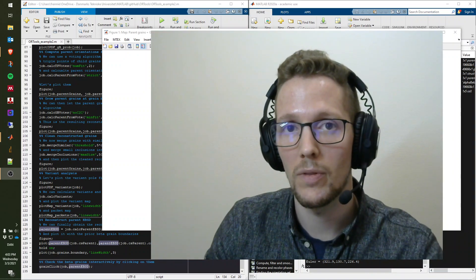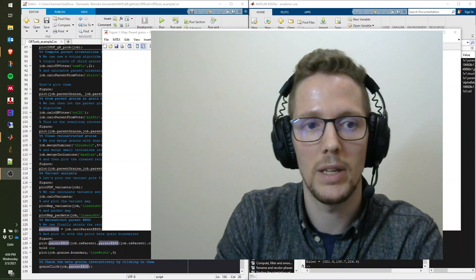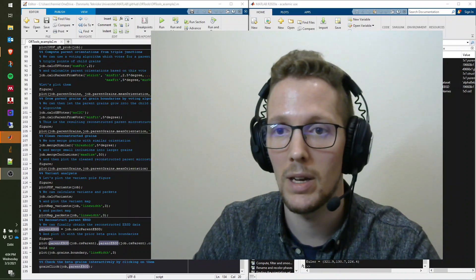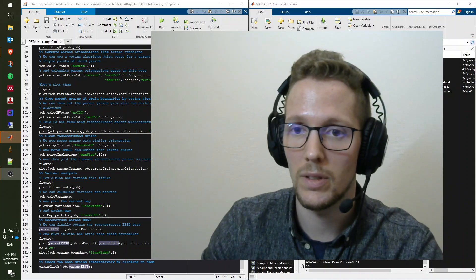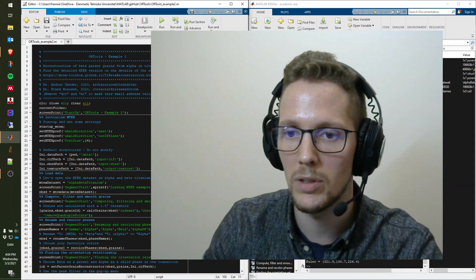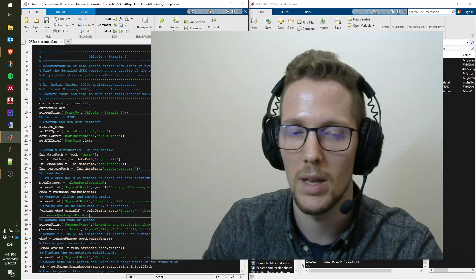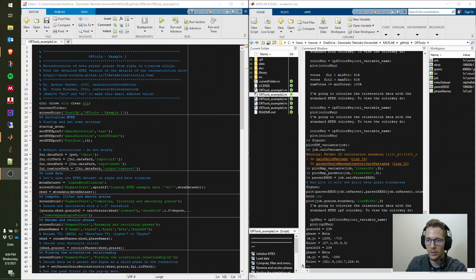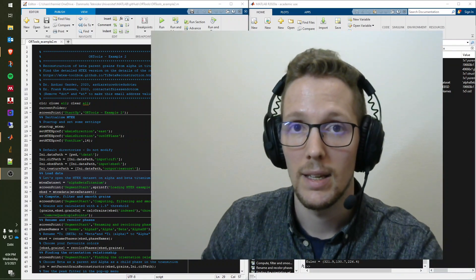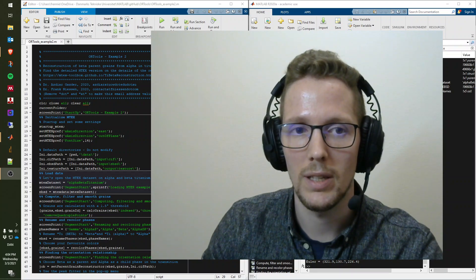That's it for this example. Just as easily as we reconstructed steel microstructures, we can do the same for alpha-beta titanium alloys. In fact, this syntax is not limited to any particular crystal structure — as long as you provide the correct crystal structure information, you can handle any martensitic system. While we used the MTEX alpha-beta titanium dataset here, you can use the import wizard to load your own dataset and apply this script to analyze your own microstructure.